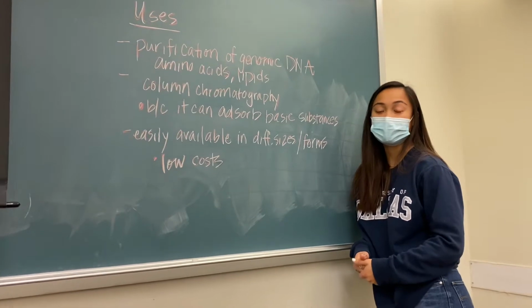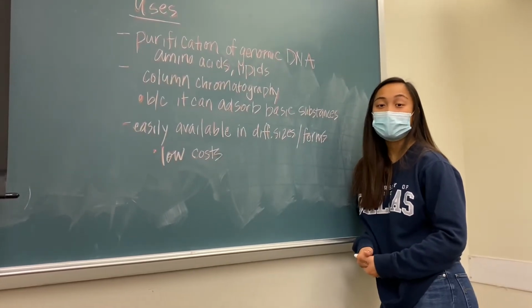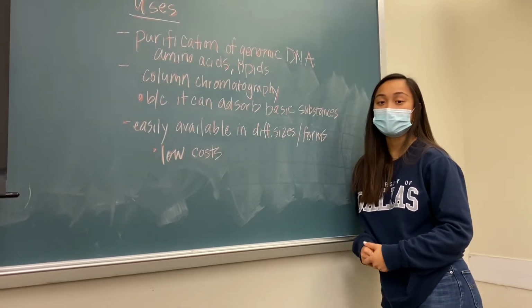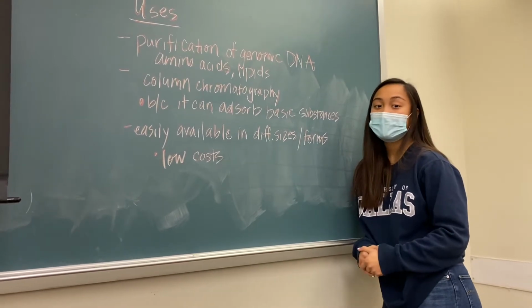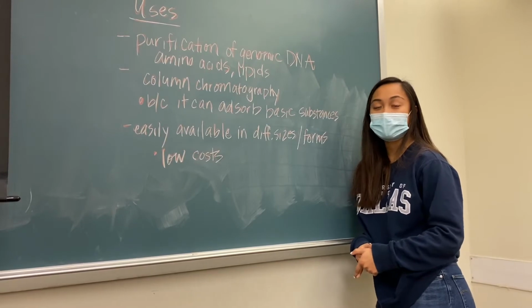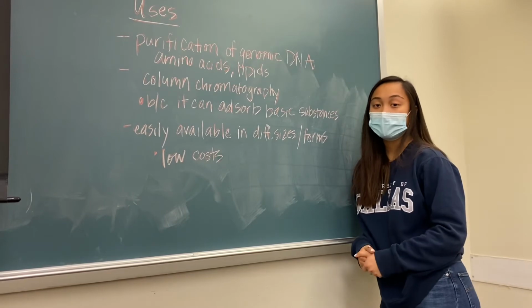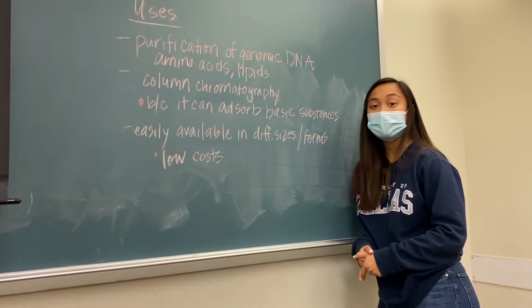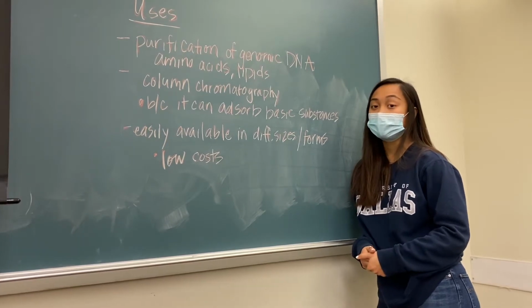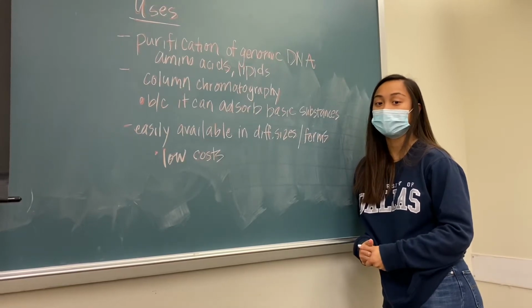Purification of genomic DNA, amino acids, lipids, and steroids. Spin column based nucleic acid purification, also DNA extraction procedures, can also be performed with this technique. Gel extraction kits use silica columns, as well as PCR, which is polymerase chain reaction purification. And then silica gel is very easily available commercially in different sizes and forms, and it can be regenerated or reused numerous times, therefore lowering the costs of purification significantly.